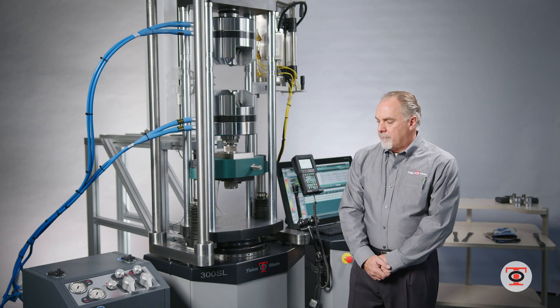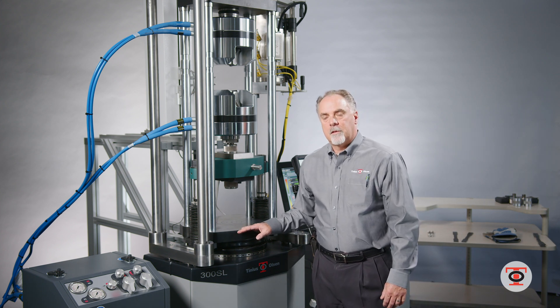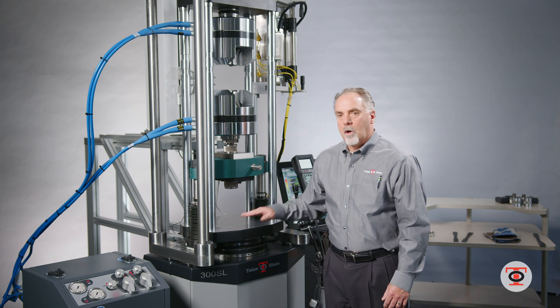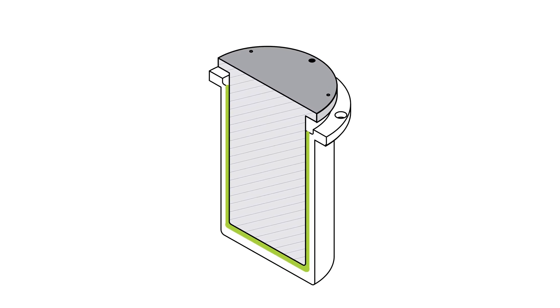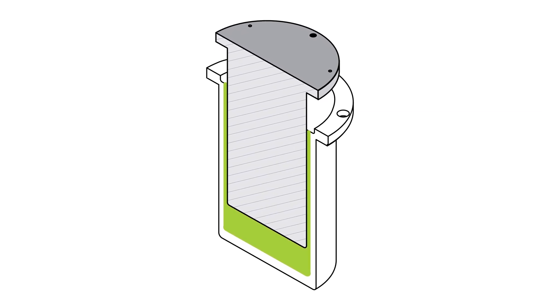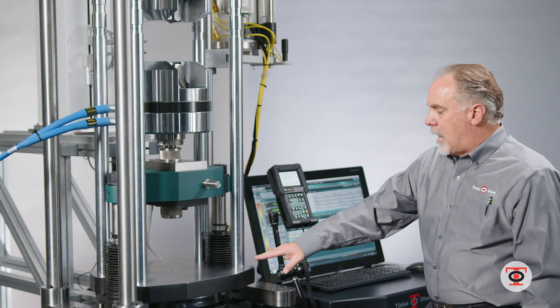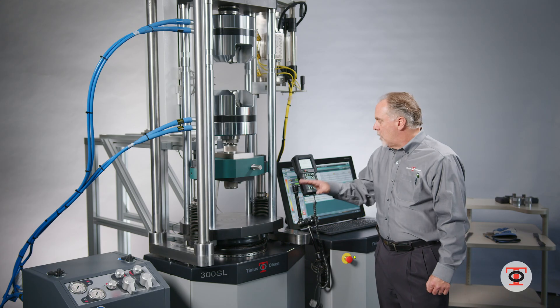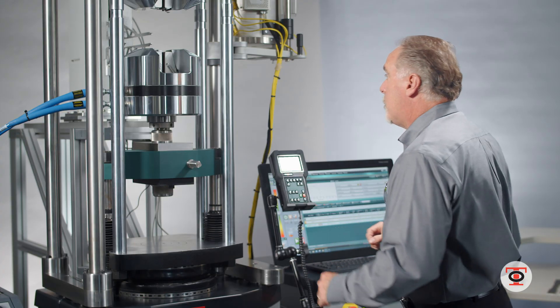I'm going to be running a test with the SL, and one of the things we have to do is home the piston. The machines automatically do this, and what that does is encase the whole piston and cylinder in oil — we read that oil pressure very accurately and repeatably. The piston is coming up off the bottom; there's no need to zero it out, it finds home at exactly the same spot, and I'm ready to put my specimen in.